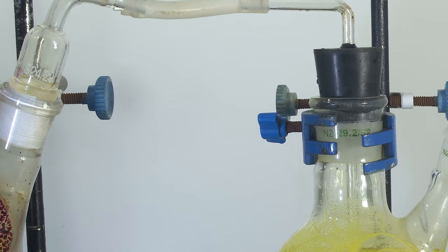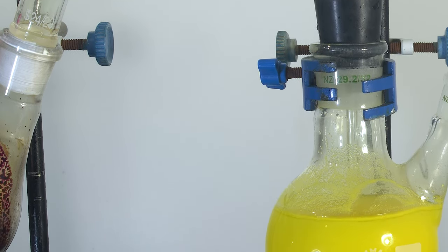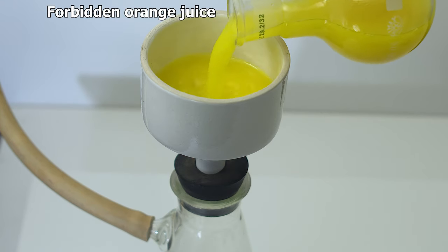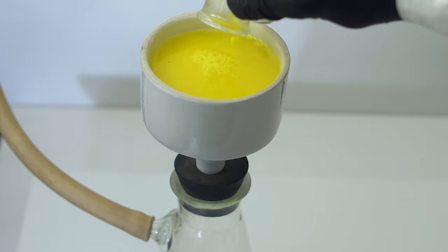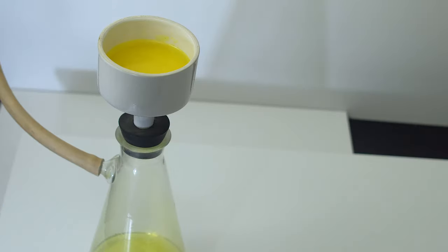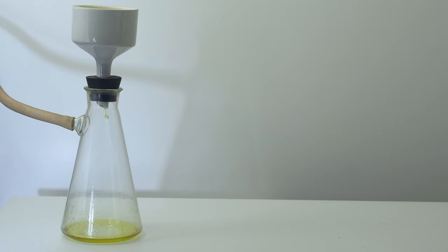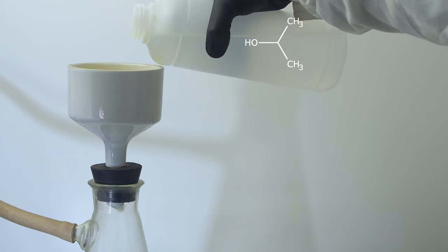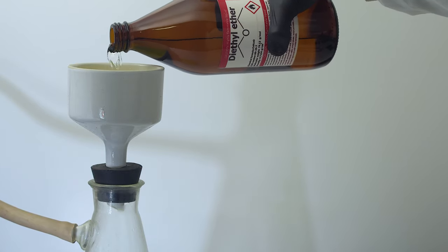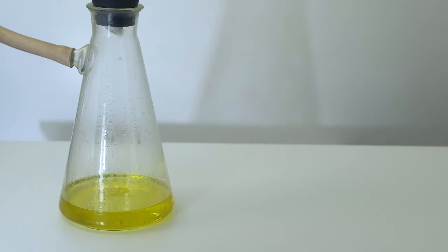After that, we bubble chlorine for another 15 minutes and filter out the precipitation. Then we wash the precipitate with isopropanol, followed by diethyl ether, and dry it in a desiccator.